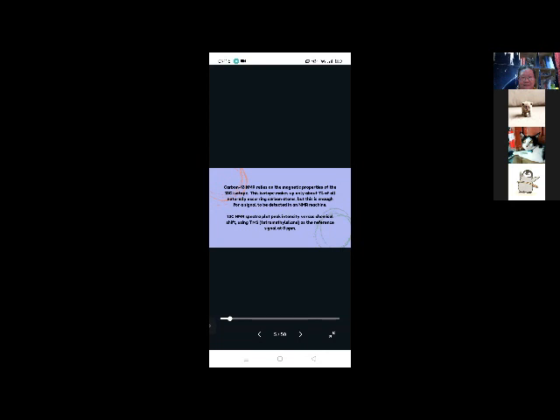So carbon-13 is the application of nuclear magnetic resonance spectroscopy to carbon. It is similar to proton NMR and allows the identification of carbon atoms in an organic molecule. Carbon-13 NMR relies on the magnetic properties of the carbon-13 isotope. This isotope makes up only about 1% of all naturally occurring carbon atoms, but this is enough for a signal to be detected in an NMR machine.